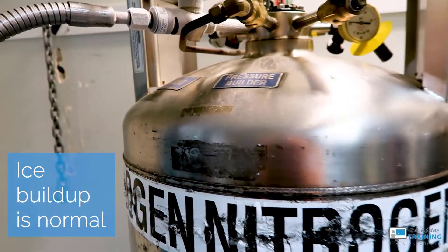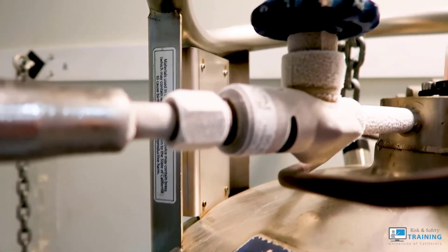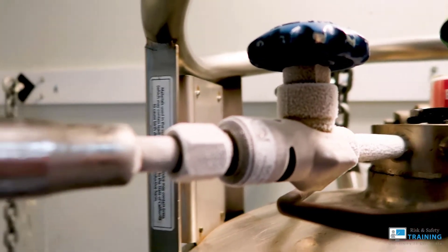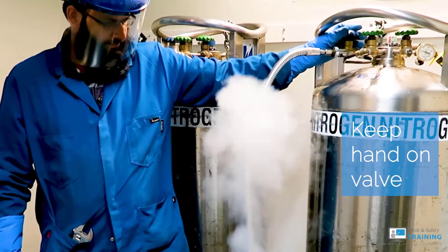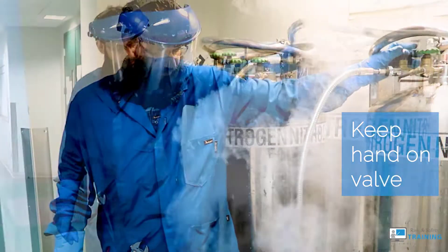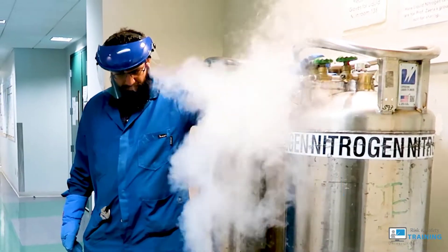Notice that ice buildup will occur on the connections. This is normal and an important reason why you should be wearing cryogenic gloves. Keep your hand on the valve while it's filling — this will help control the flow. If it overflows suddenly, you'll be in the best position to turn it off.